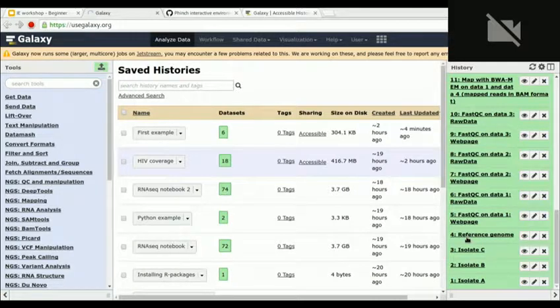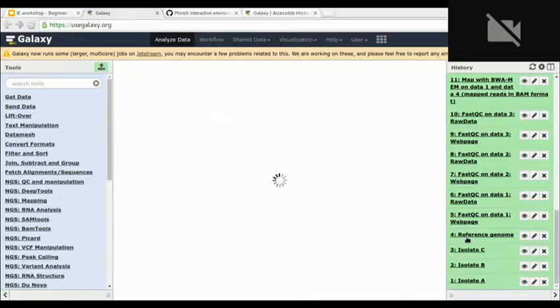So what we do here is that we pulled out related data; this is not real HIV per se. We have three isolates. For example, these are samples from a single individual over some period. So three isolates of HIV.